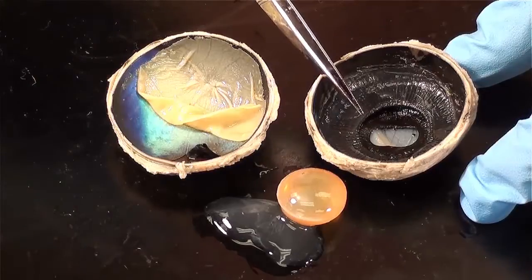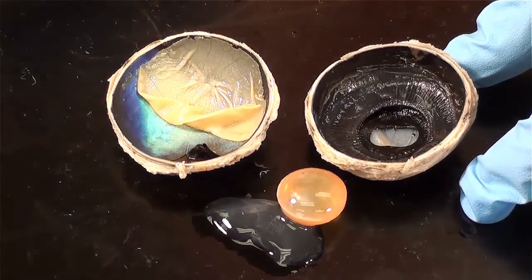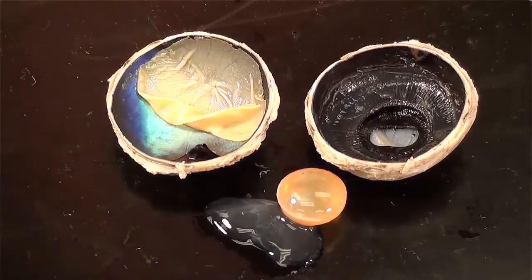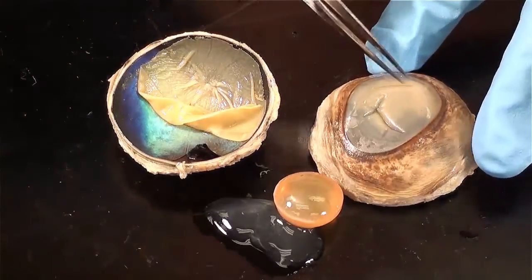Suspensory ligaments connected the edge of the ciliary body to the lens, holding the lens in place. If I turn over the anterior portion of the eye, we can see the cornea.